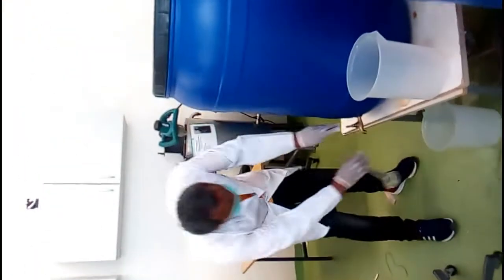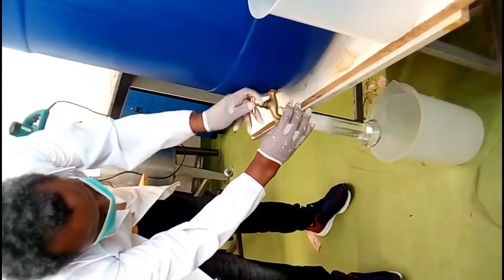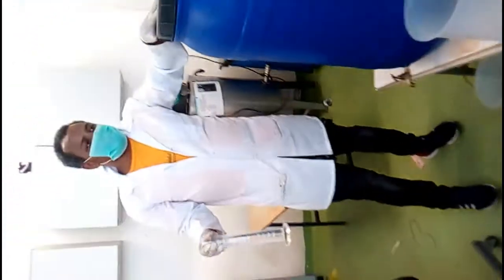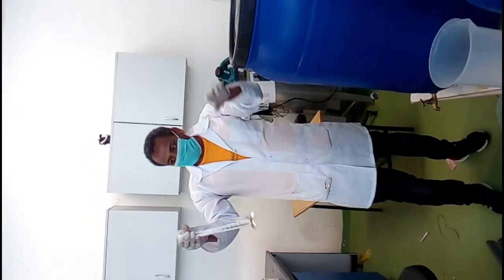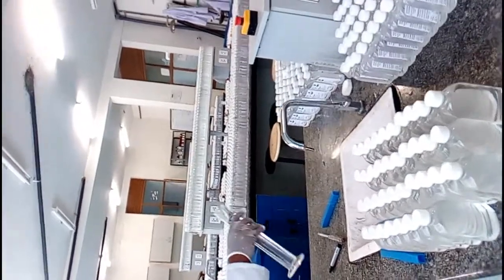Let's come to the normal sample prepared here. In our case, let's take our sanitizer that we prepared in the lab. We are taking our mixture containing four components: distilled water, glycerol, hydrogen peroxide, and ethanol. The ethanol is 80%, we say. So let's check whether this reading shows 80% or not. Let's check by using alcohometry here.